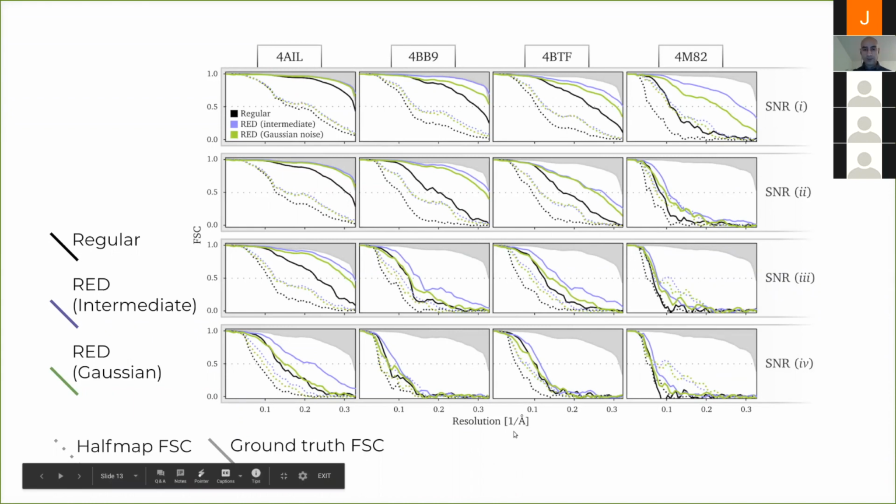And I should mention here that because we simulated our data, we were able to do this analysis very, very thoroughly. We know exactly what angles we have, and we know that we only have a single class. We can control all of these things, and that was the main reason we went with simulated data for this proof of concept.